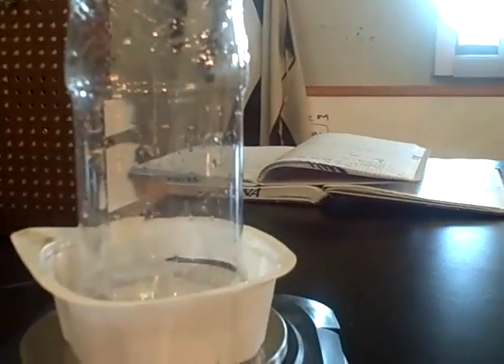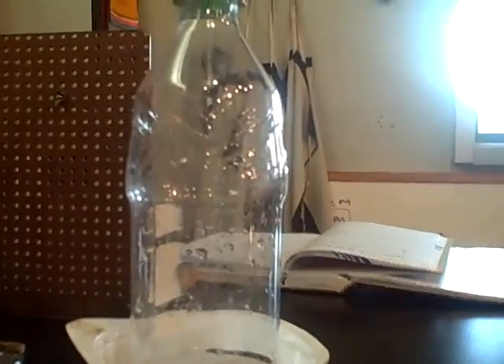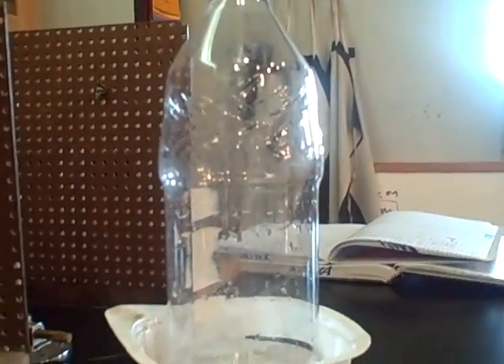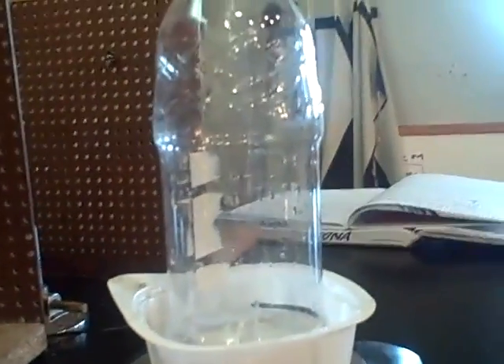Thank you very much. This has been a science experiment, Experience 2.6, the mass of gas. And yes, there is a change in mass of about 0.10 grams when the cap is loosened. Though we probably had a source of air, so there's really no definitive change in mass.